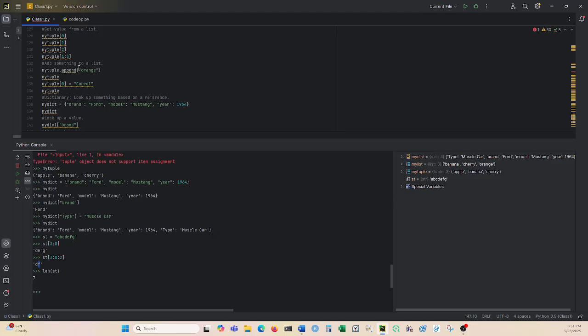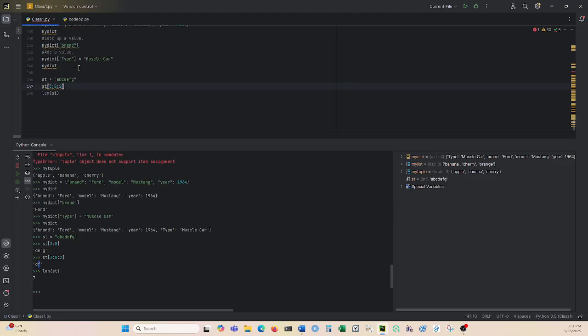But next class will be actually doing things that are more useful, things you can learn that are more useful, like pandas.